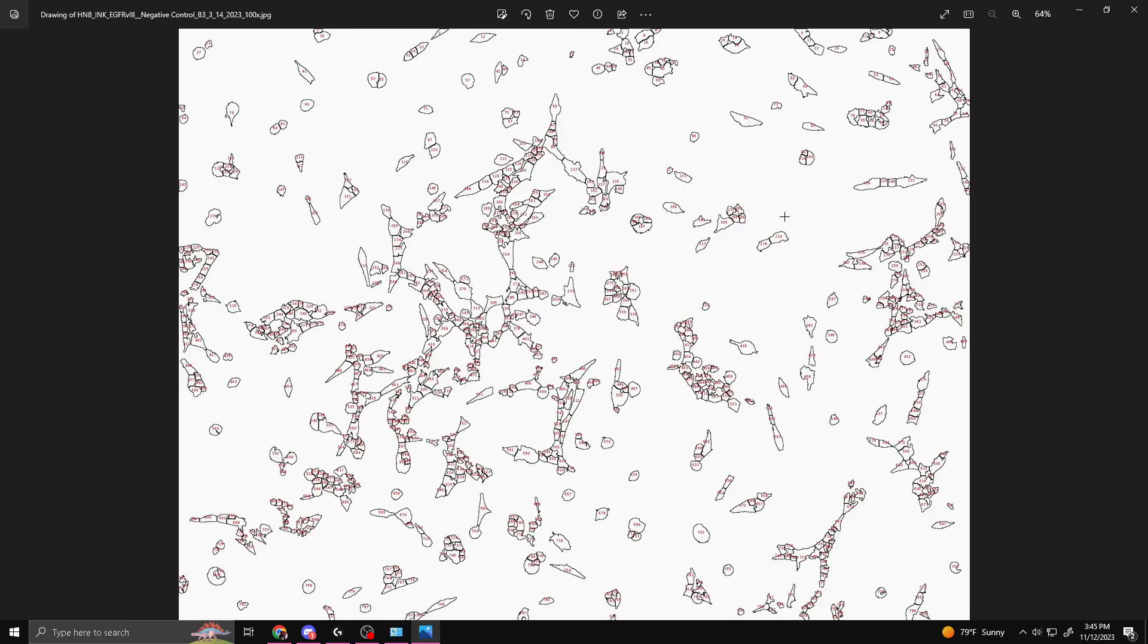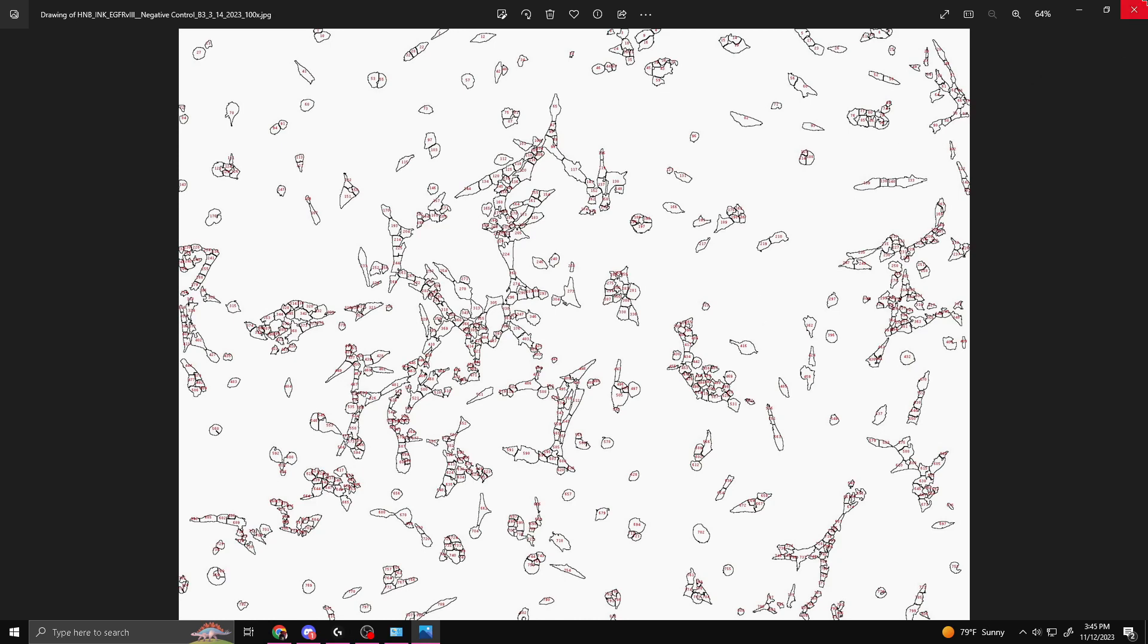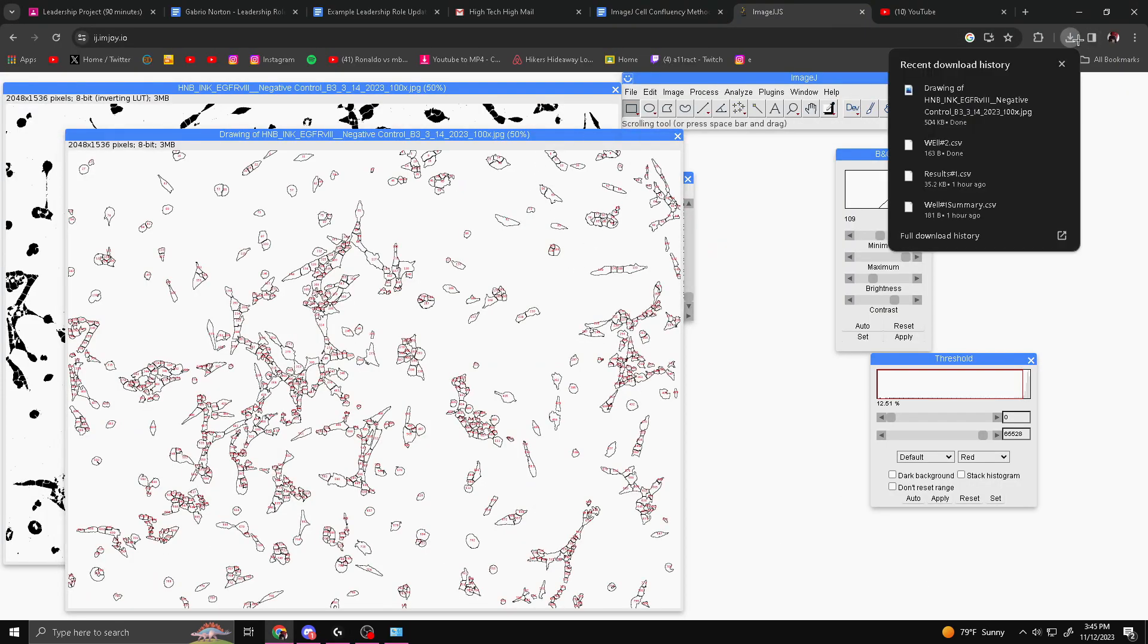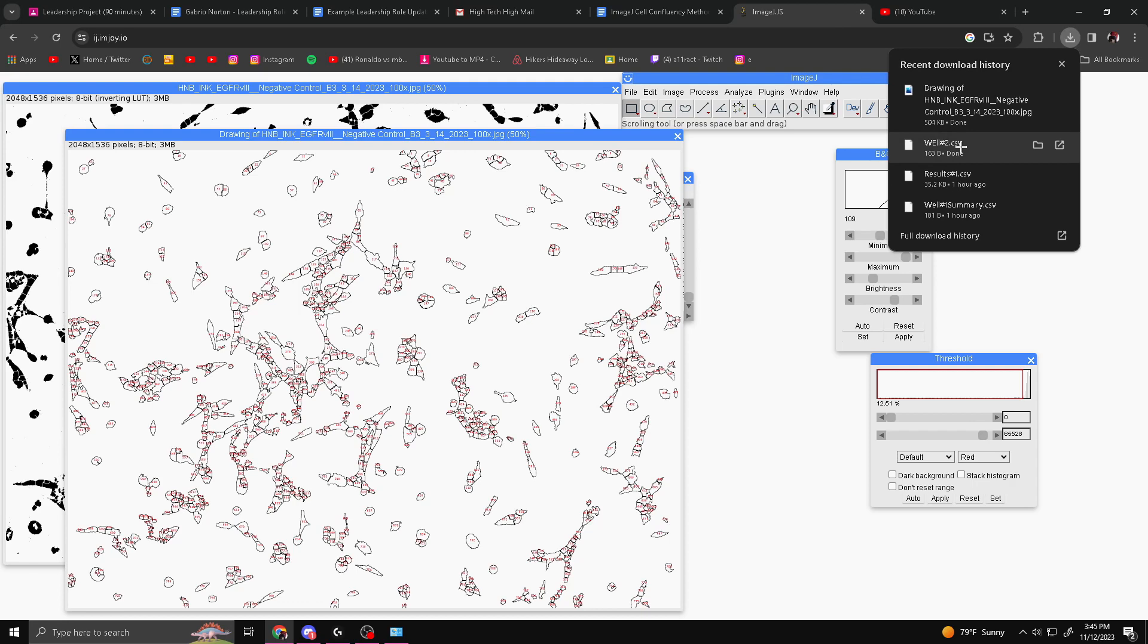Then it'll bring you to your image. Now you want to upload the files you just got to your folder. As you can see, we have the drawing and then the text box. I'm going to upload these to Google Drive.